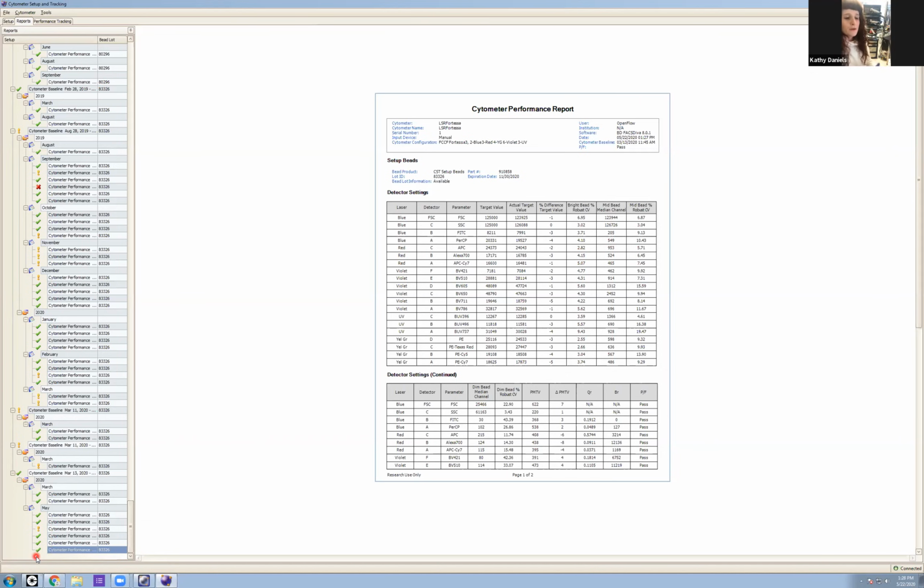And it's an important note here that as you're running the performance check or any type of QC that's defined by your facility, if it does not meet the acceptance criteria, typically what we suggest in our facility is to do a round of deep cleaning, because most often there might be an issue with the cleanliness, and then try and repeat.